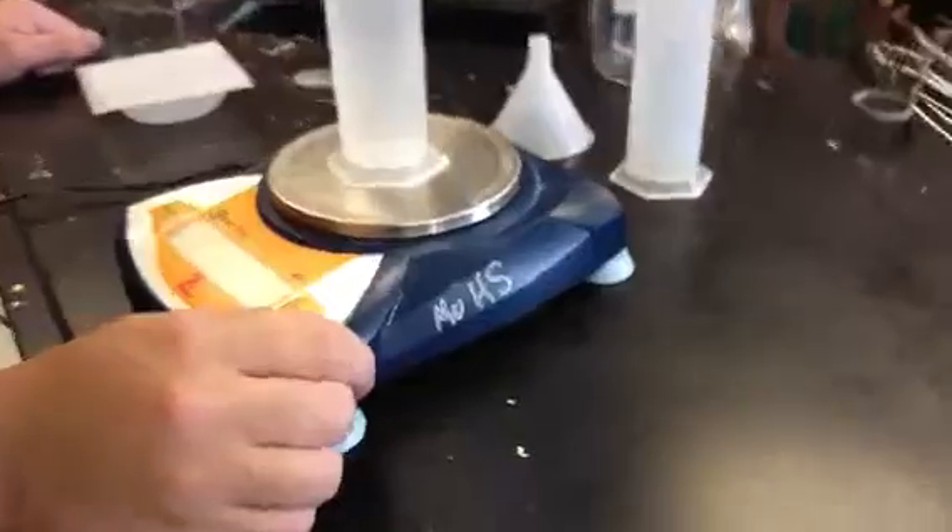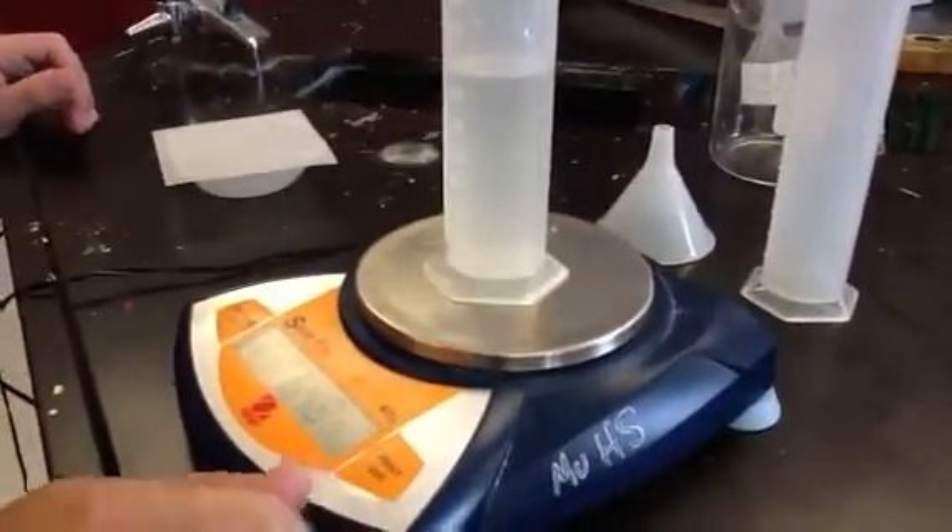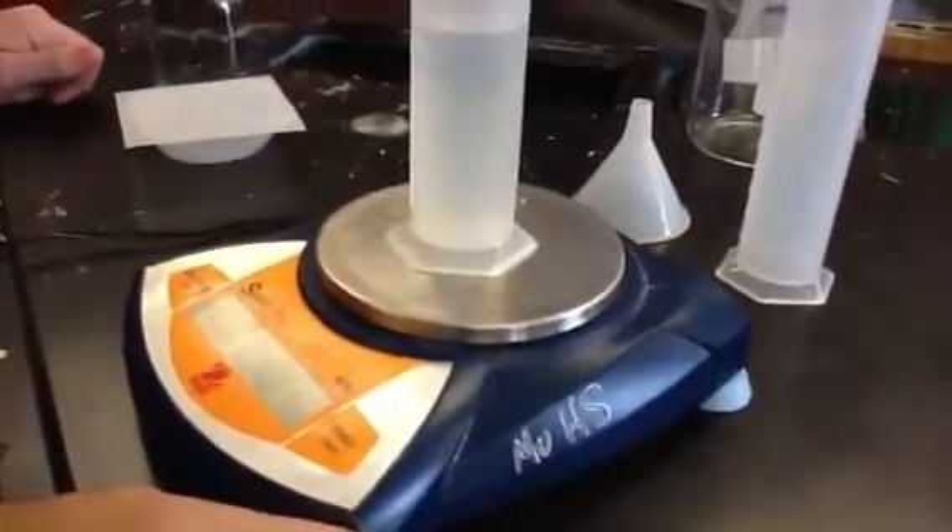We're going to presume they have the same mass. And then just weigh it. And how much does it weigh? 64.8 grams.